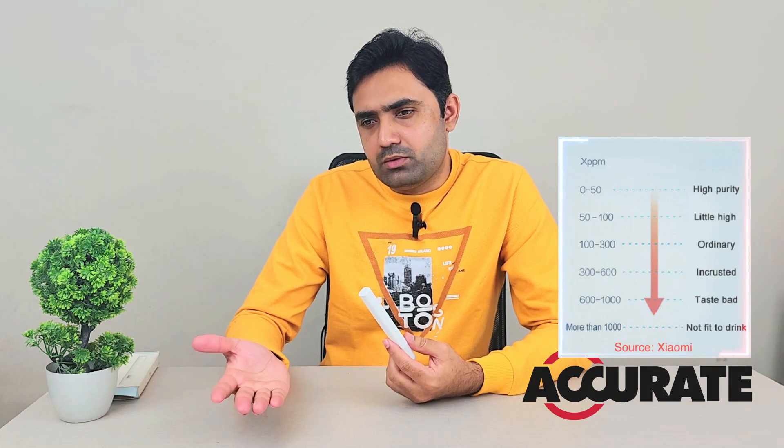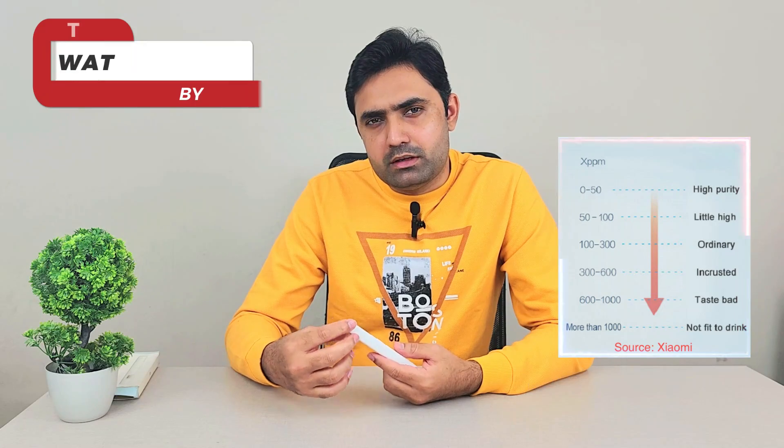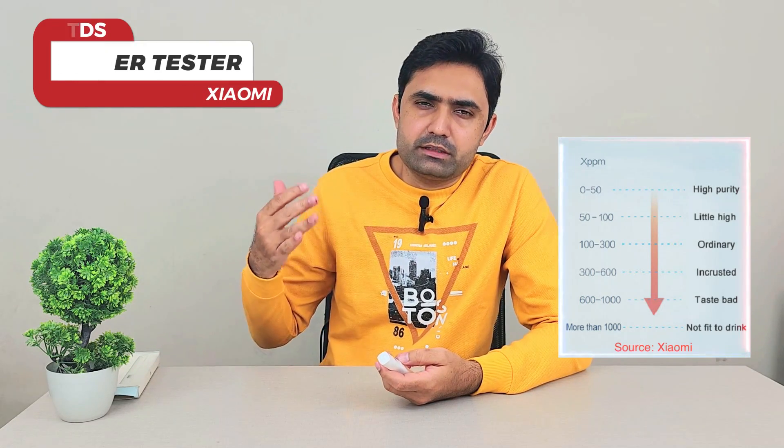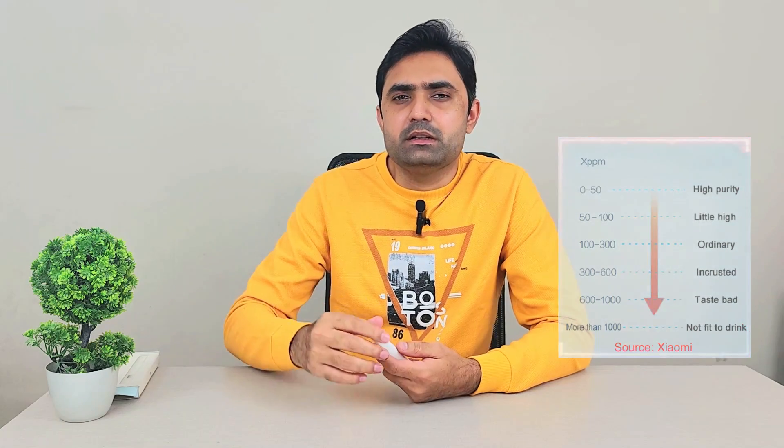It gives you a number between zero and ten thousand maximum, and that number correlates to quality categories — excellent, good, fair, and so on. You can see that chart right here on the device.